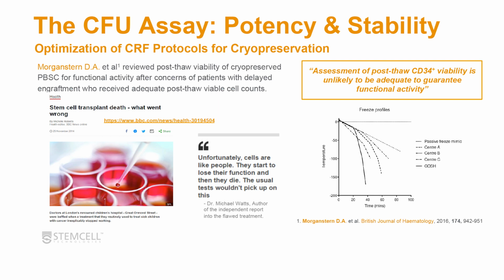The CD34 viability looked great, but when he compared the CFU-GM or CFU output from these different freezing profiles, the data showed that all of them were fine except the one from the Gosh rate-controlled freezer, where that steep curve in the freezer profile was observed.